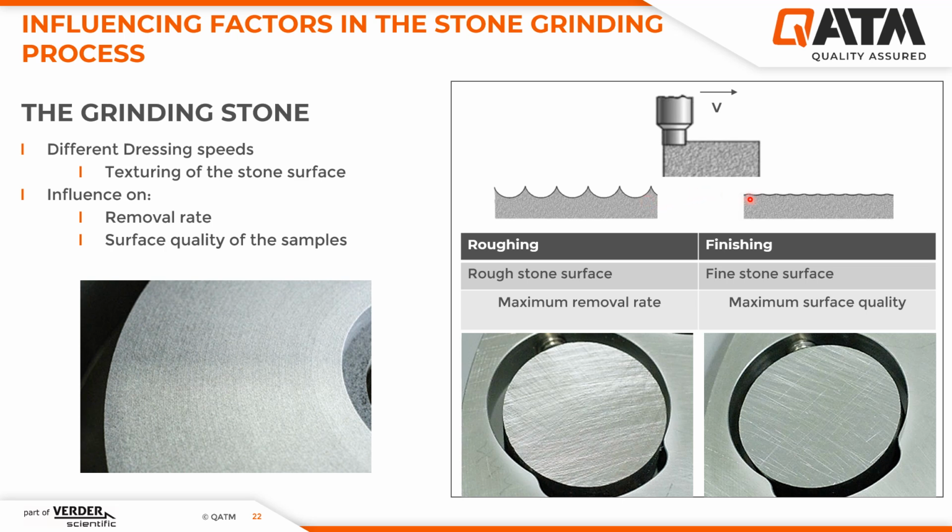Is the stone dressed very slowly? The stone has a smooth surface and also produces a smooth surface quality on your samples. However, the removal rate is low with the slowly dressed stone. In technical jargon, a distinction is made between roughing and finishing.